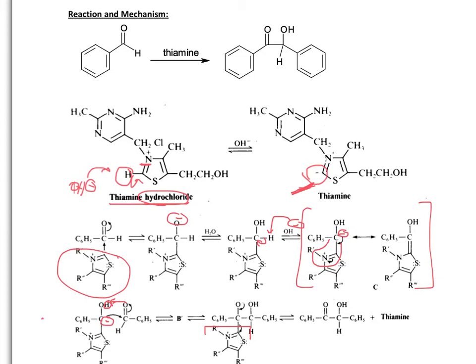So thiamine, hopefully you can see, is going to act as a catalyst. It's only going to be used up in one stage and regenerated in another stage, and your final product is going to get thrown off from the solution in a week's time. It does take time to precipitate out, but this process really is the best out of all.